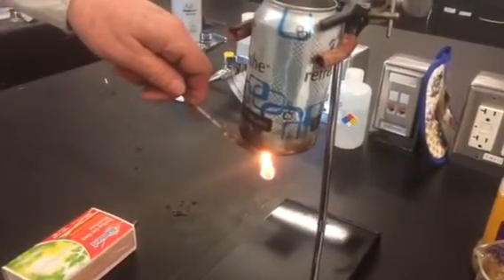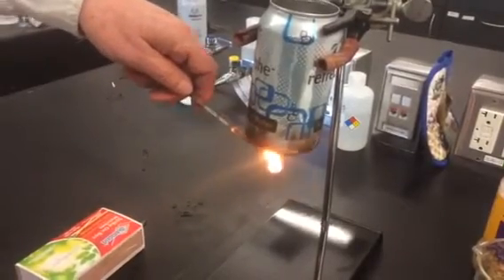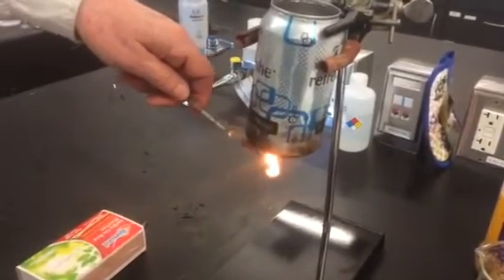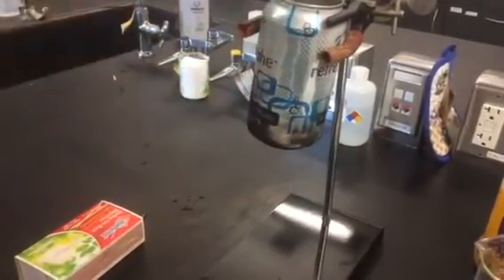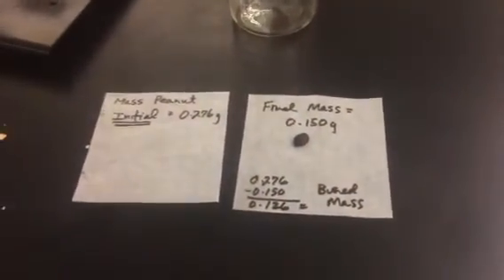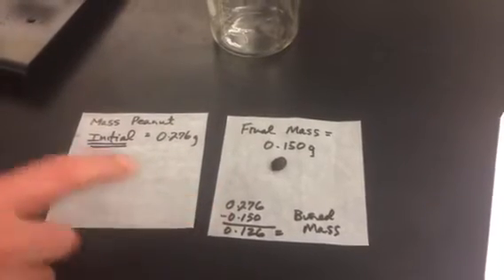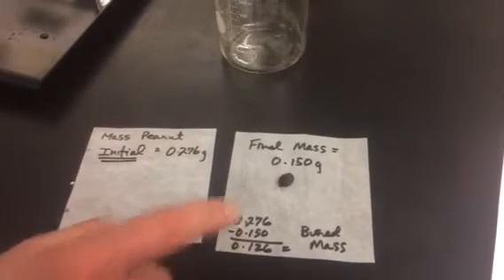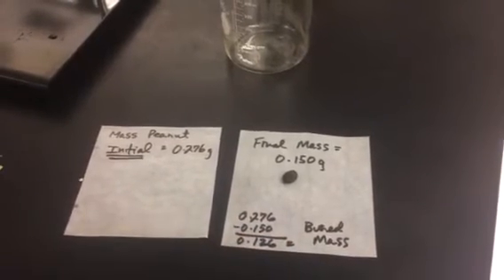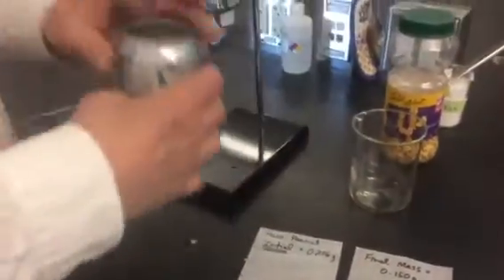I'm going to just hold it there. As the peanut burns, the ice is melting, and then at some point the peanut will go out. Then you're going to take the peanut back in and mass it again to get the final mass, and from that you're going to subtract the initial mass to get the burned mass of the peanut that is melting the ice.